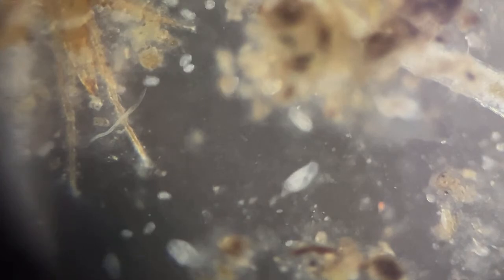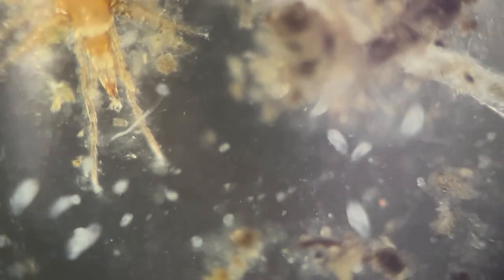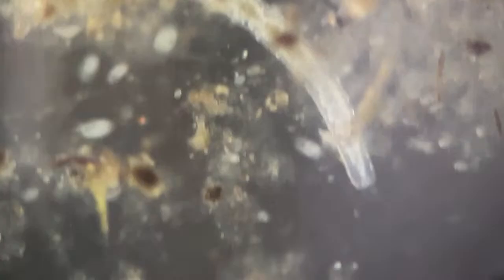The reflection from the curtain walls. Being a reflective light system, I've realized I need to close in all other light sources. So that will be the next mission. But for the time being, the mission is to see the heartbeats.